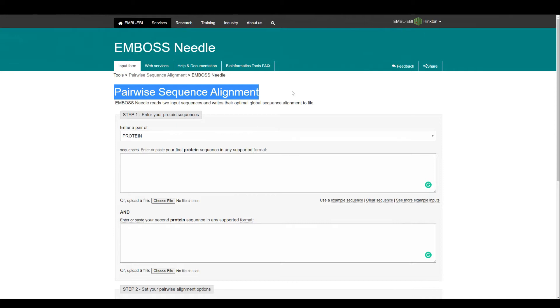There are multiple alignment tools that you can use, and one of the tools that you can use is Needle. For that, what you need is the protein sequence and it's pairwise sequence alignment, so you need two sequences.